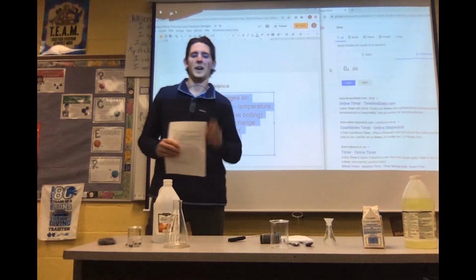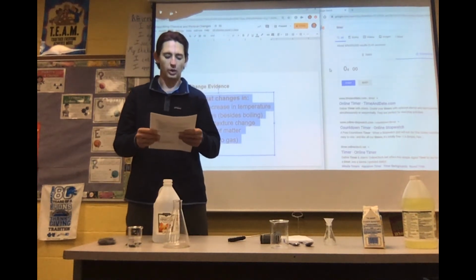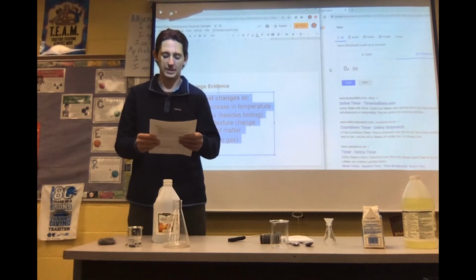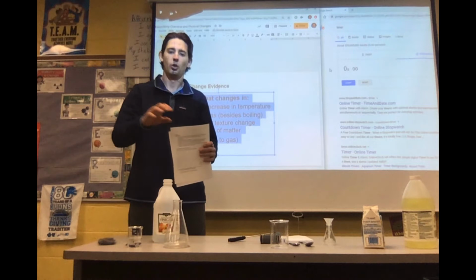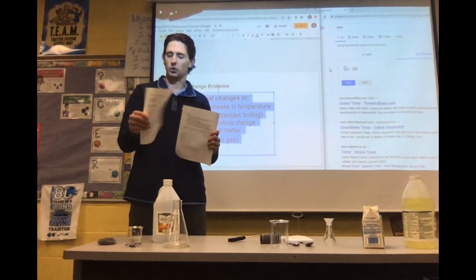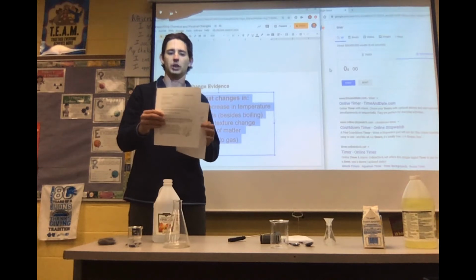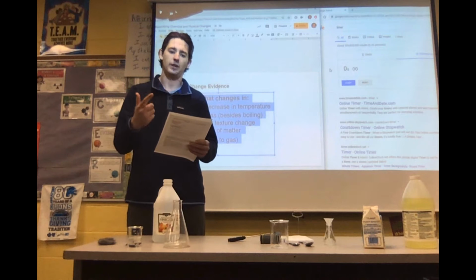Welcome back. All right, we are on day 2, exothermic reaction. Task 1, watch the video and fill out the data table. Steel wool and vinegar reaction. You're going to watch what's occurring here, fill out the longer, wider data table, and make sure you're writing down the temperature and the observations.